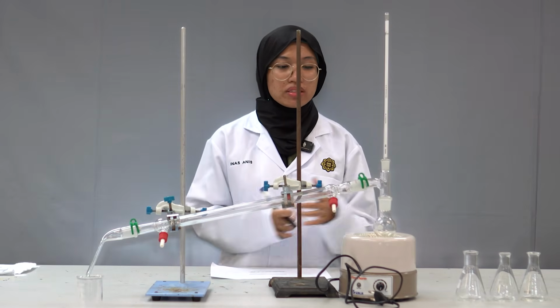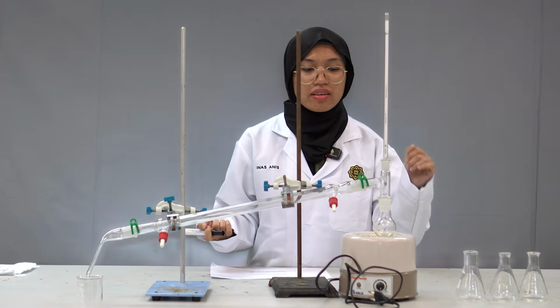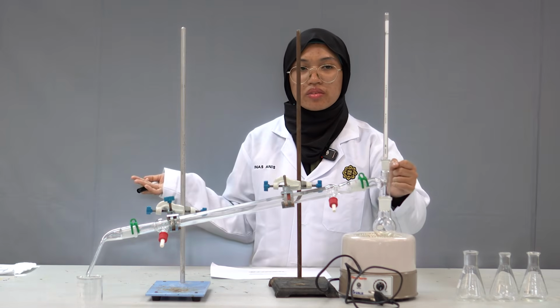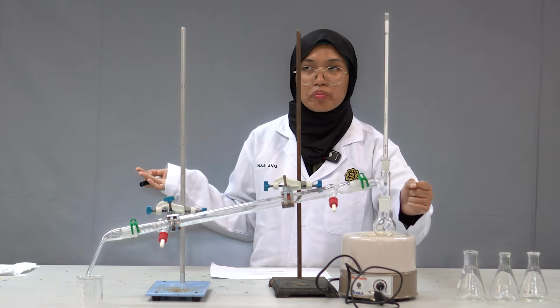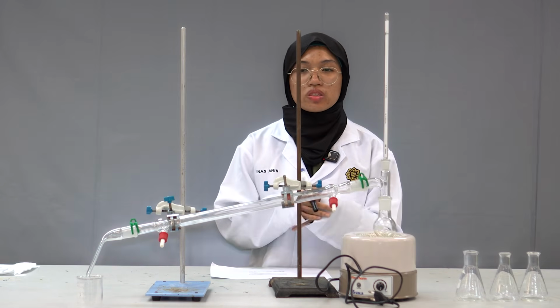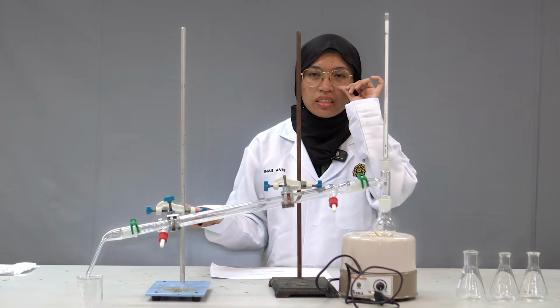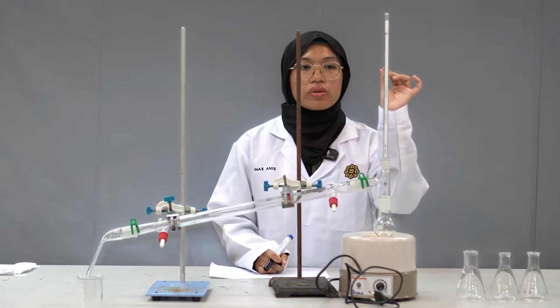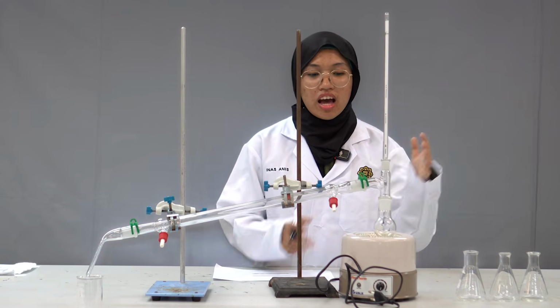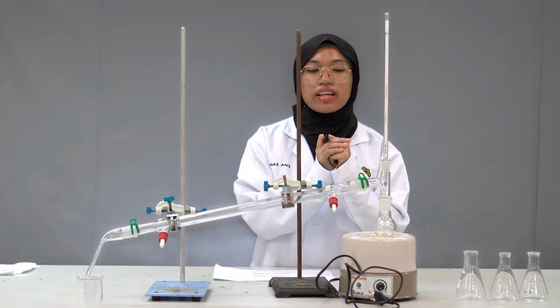Next, once we've prepared our mixture, we will heat it up, and as my friend mentioned earlier, the principle behind distillation is the different boiling points. Dichloromethane has a boiling point of 40 degrees Celsius, and we have our thermometer here to make sure that our mixture is at 40 degrees Celsius.